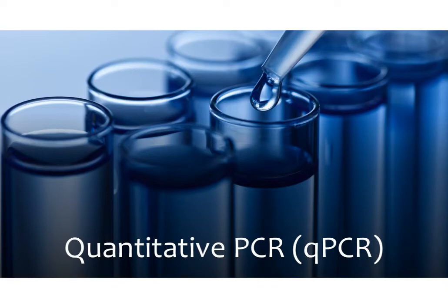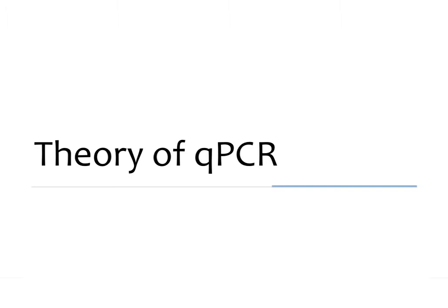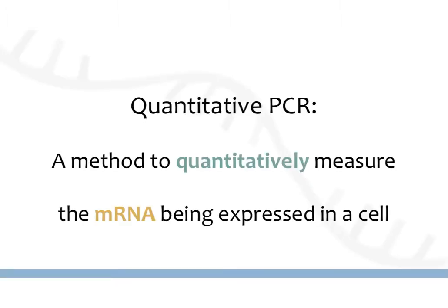In this video, we will discuss quantitative PCR, otherwise known as qPCR. Let's start by talking about the basic theory behind PCR. So quantitative PCR, otherwise known, as we said, as qPCR, is a method that allows you to quantitatively measure the mRNA being expressed in a cell.